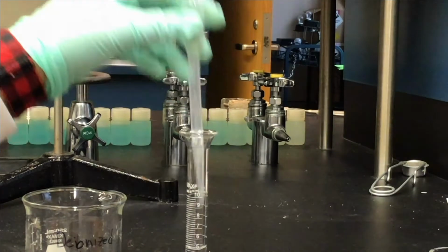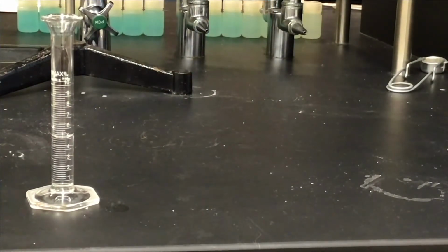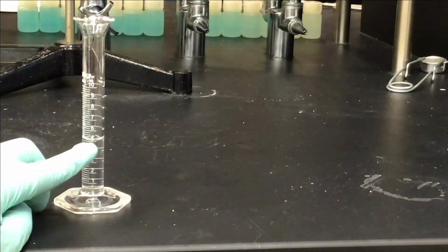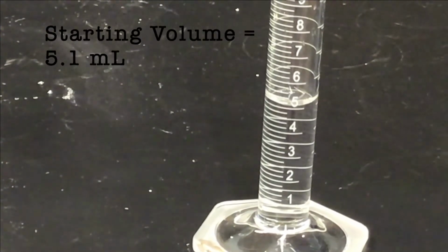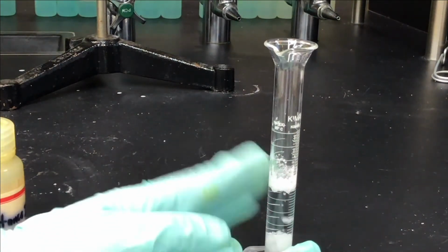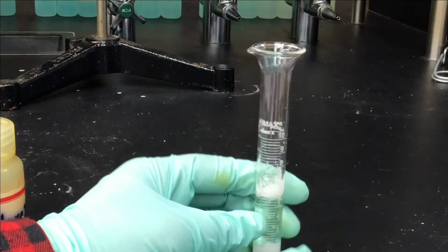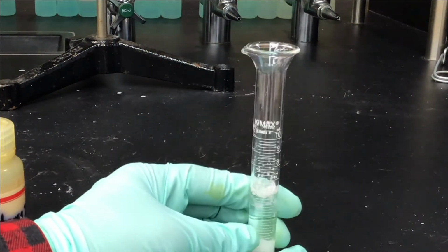Once we finished adding our water, we want to make sure that we're carefully recording the volume. It may be difficult to see because of the angle, but the bottom of the meniscus is at 5.1 milliliters. Next, we're going to add our 1.5 grams of our solid unknown to our graduated cylinder. With gentle taps, we're going to try to get all of our solid to the bottom of the graduated cylinder.